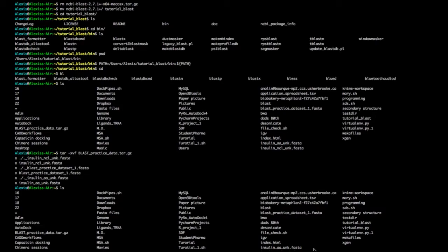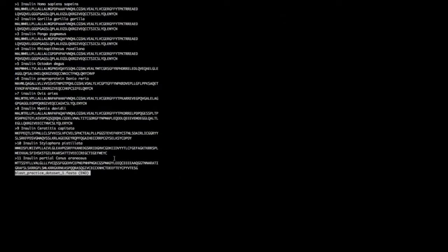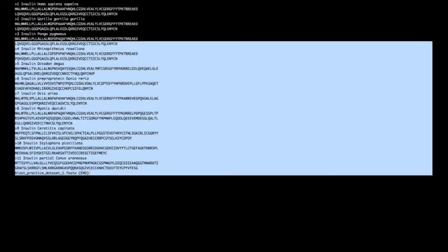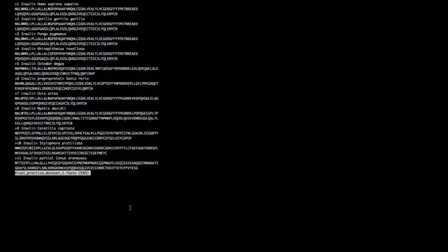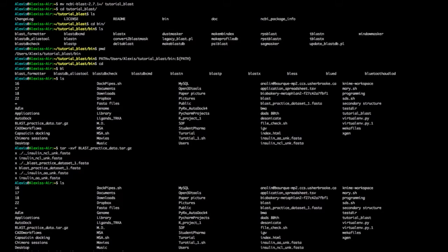Now we want to make a database from our BLAST practice data set one. If you 'less' the file, you can see we have 11 sequences from different species — a very small database that will run on anything. To make the database, we run the makeblastdb command and insert these sequences.